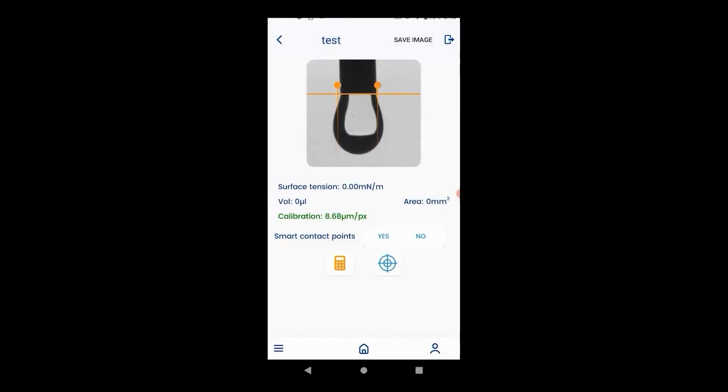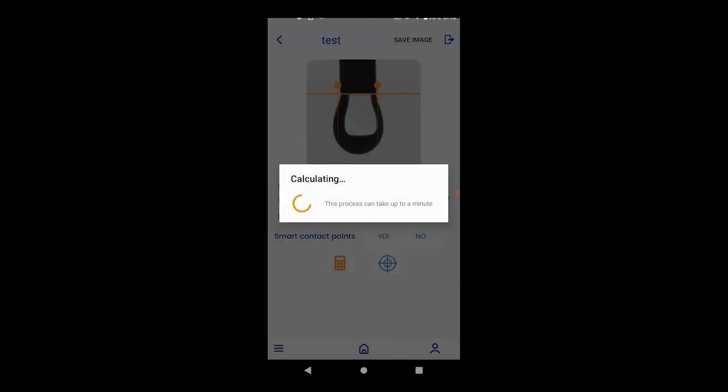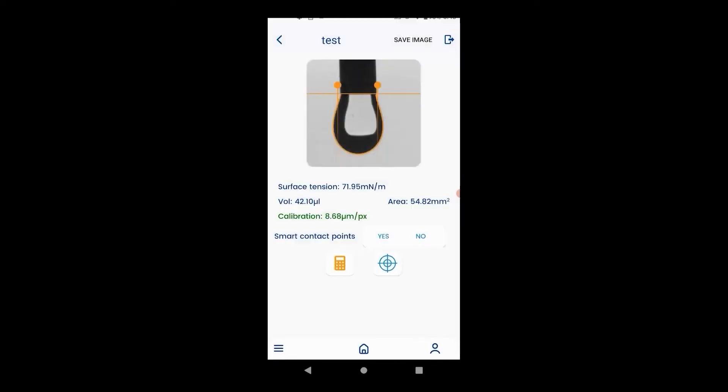Now move the orange vertical bar to where the droplet meets the needle and the two points to both sides of the droplet and hit calculate. This will give you the surface tension, the volume and the cross sectional area.